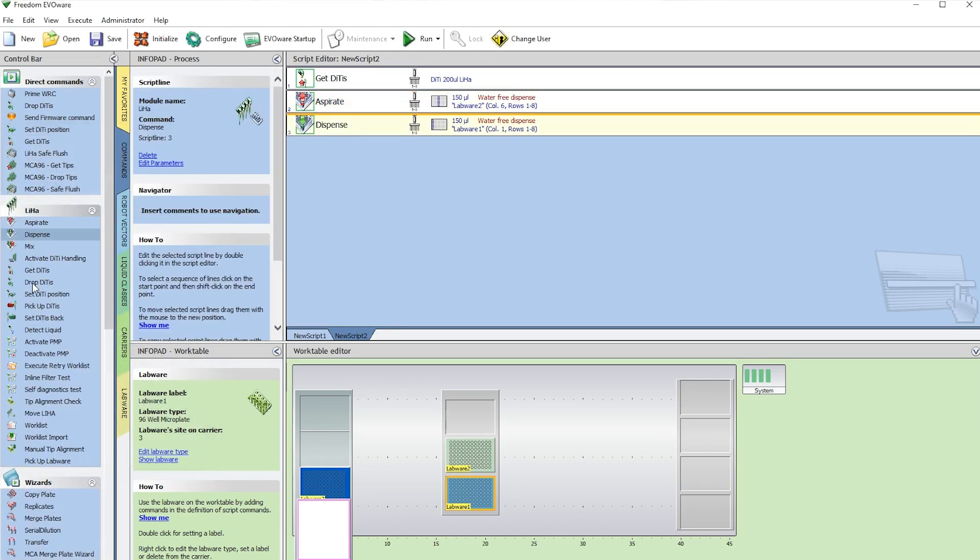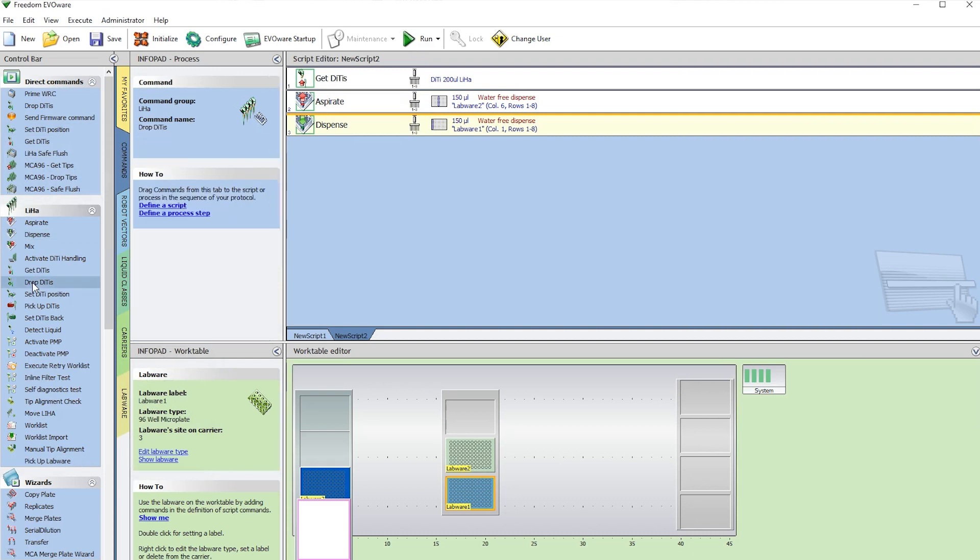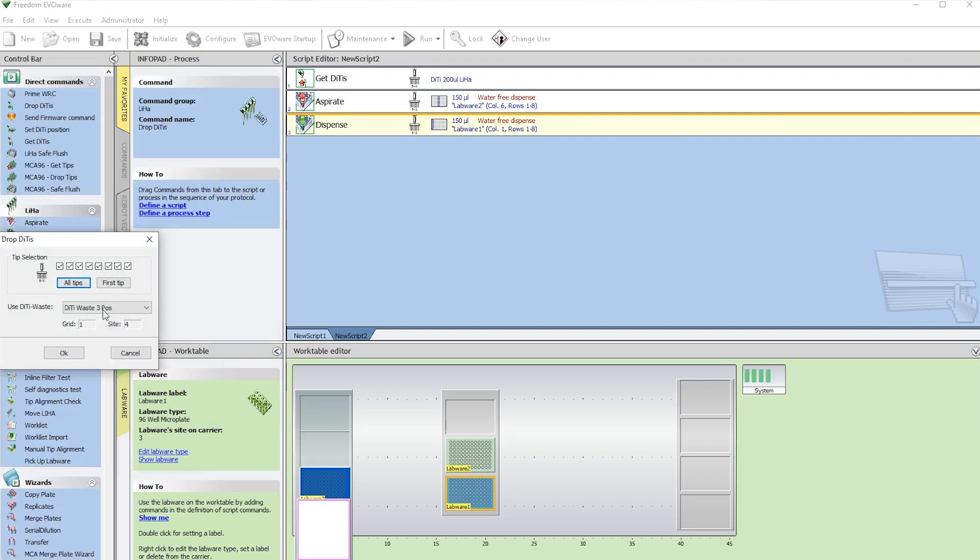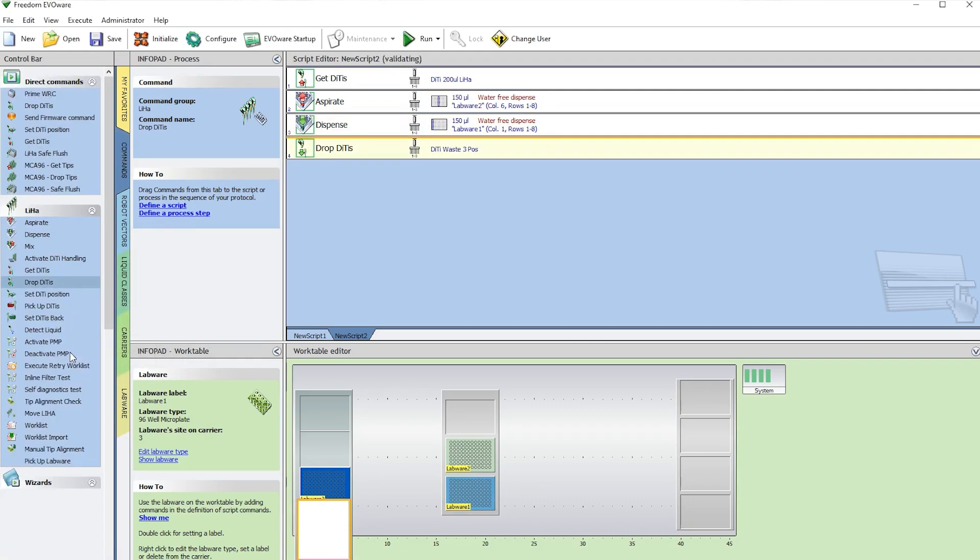Last step, Drop Tips. This is going to drop it into the waste position here. Select OK.